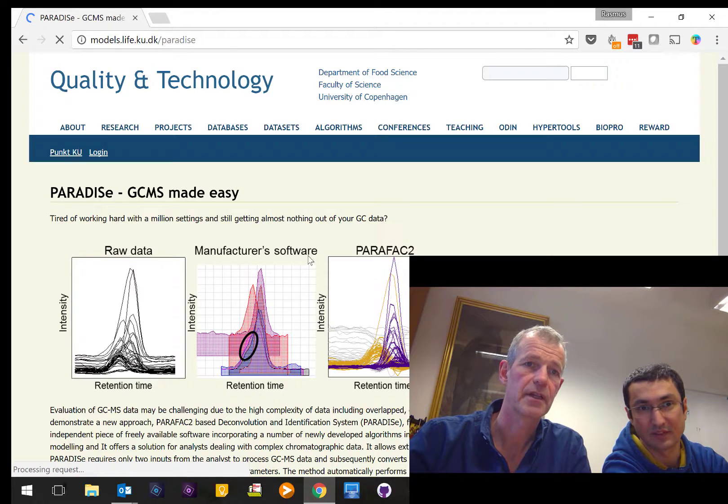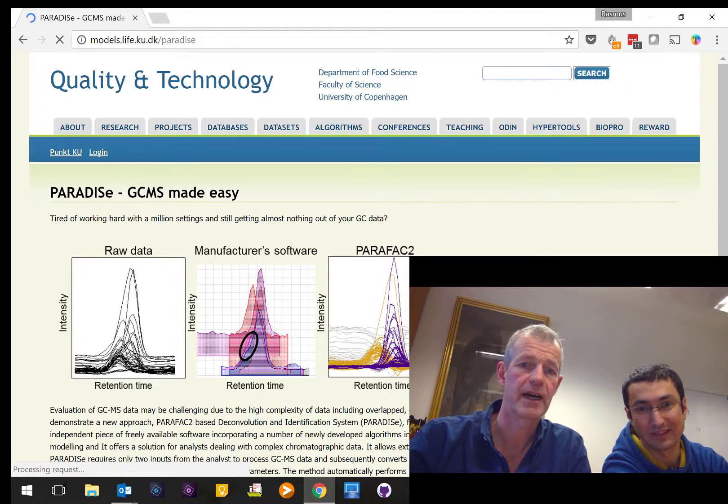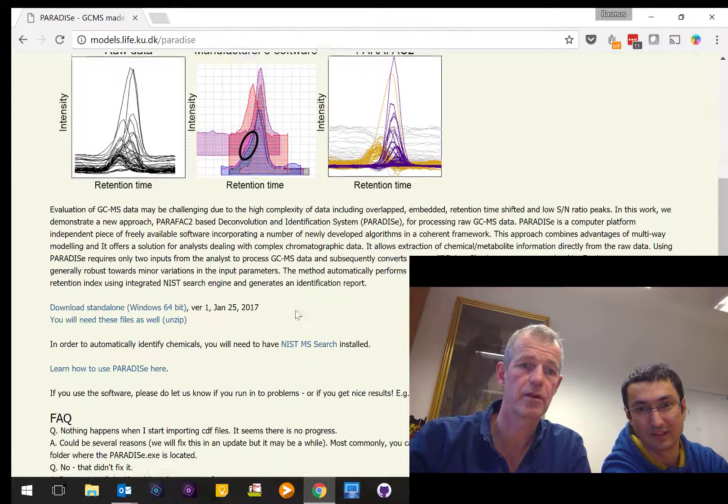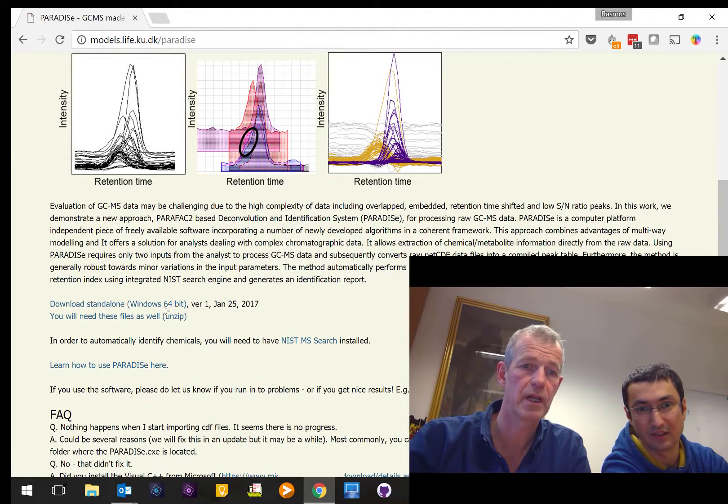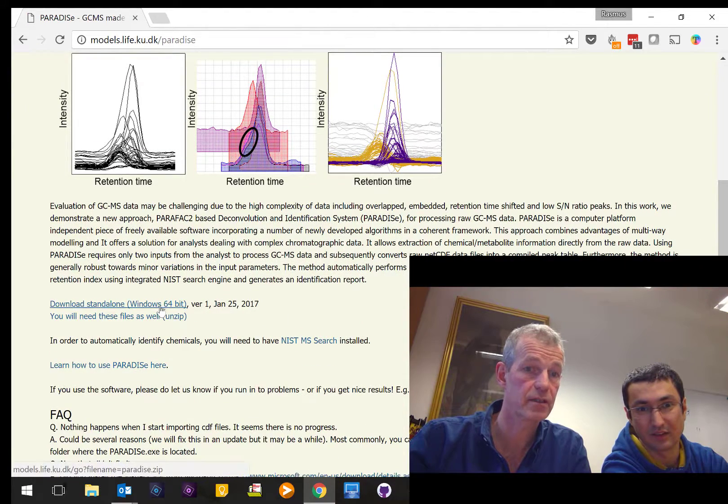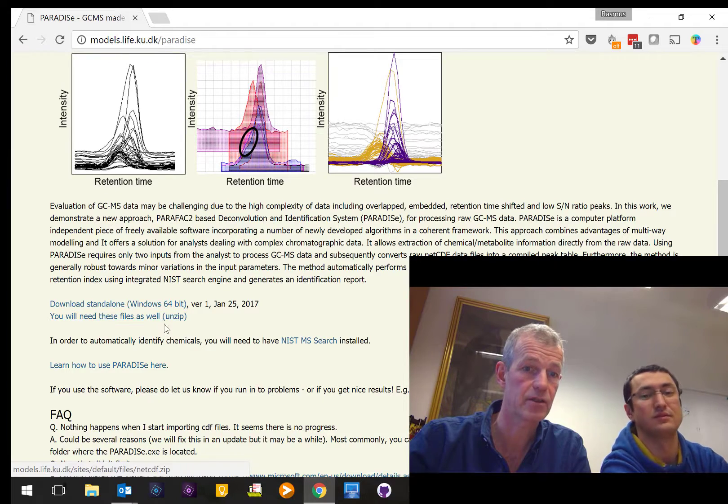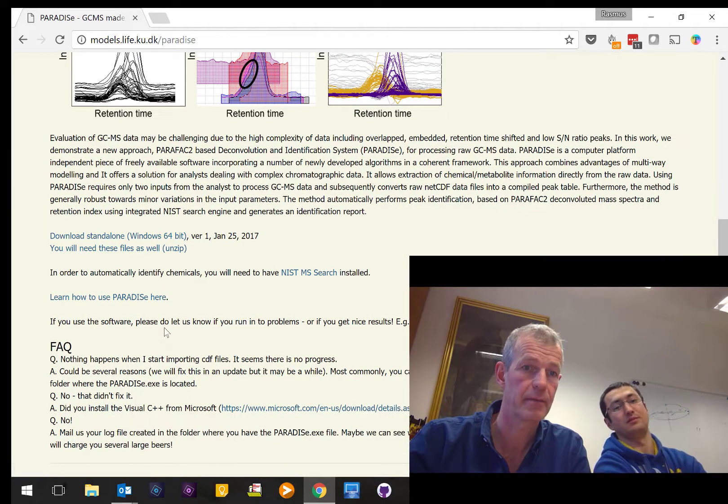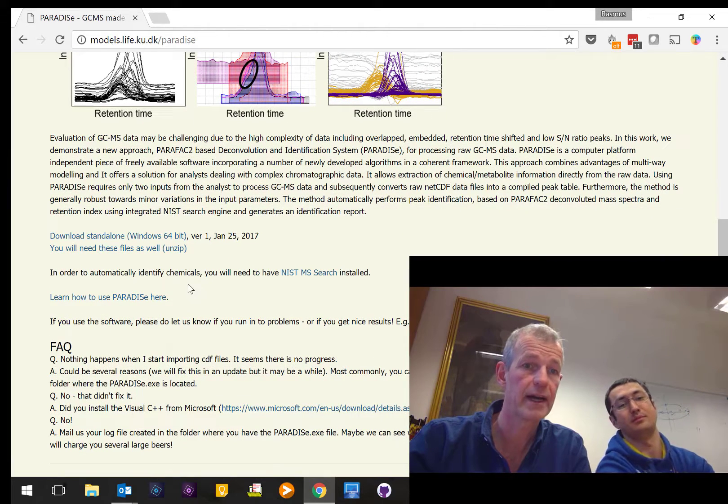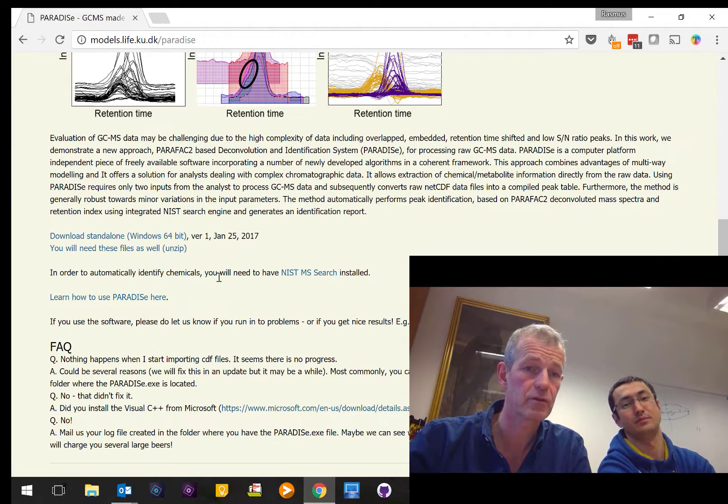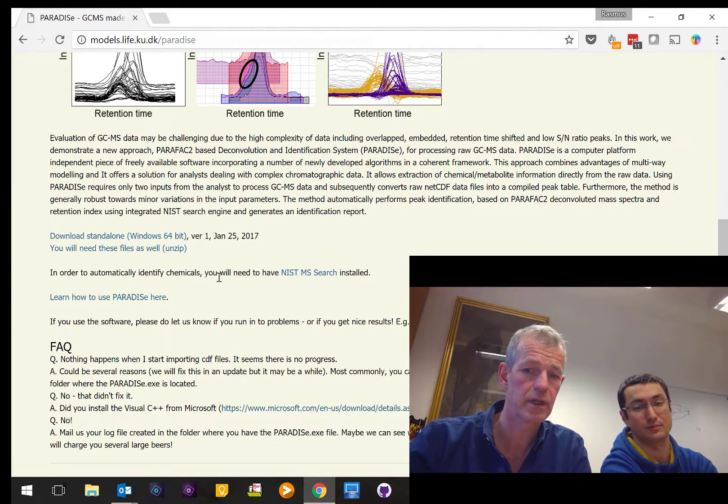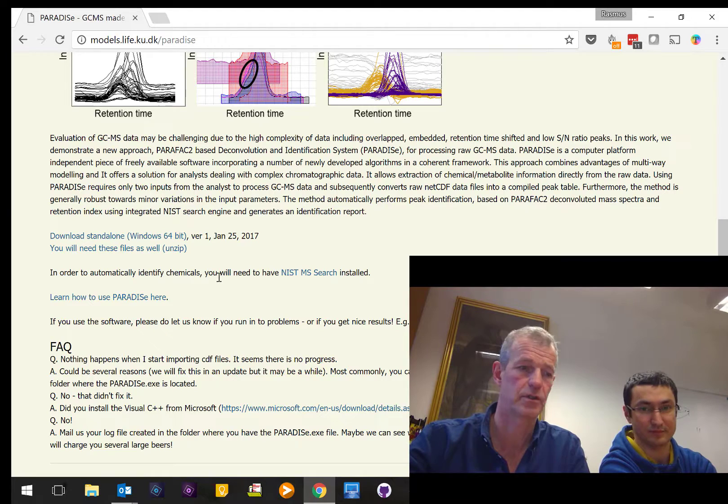On this page you are going to find a short description of the software as well as instructions on how to download and install the software. So go there and download the software and we will see you afterwards.